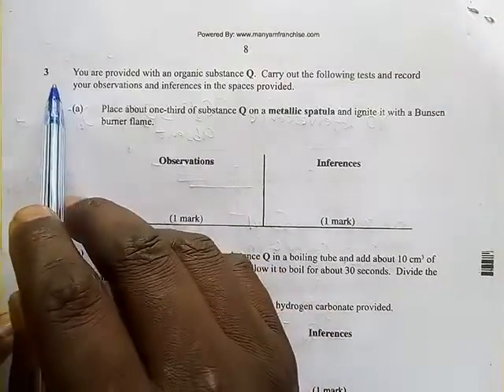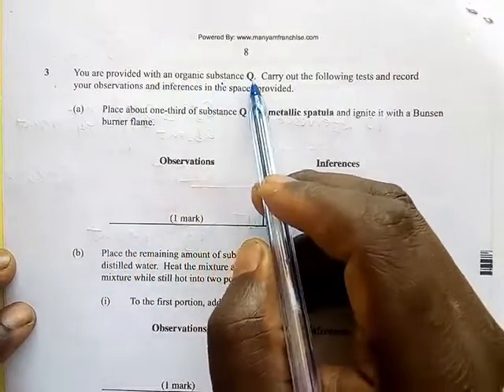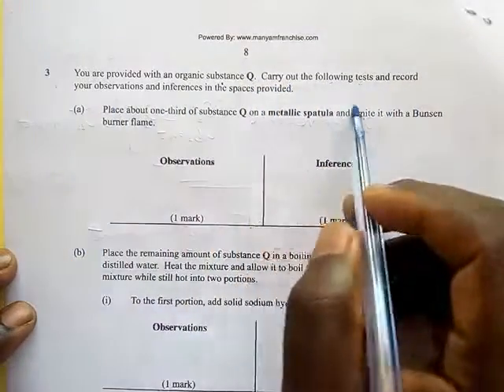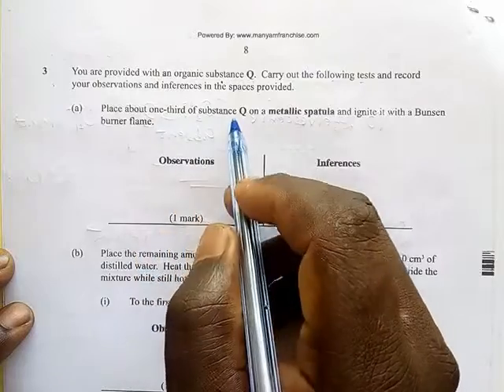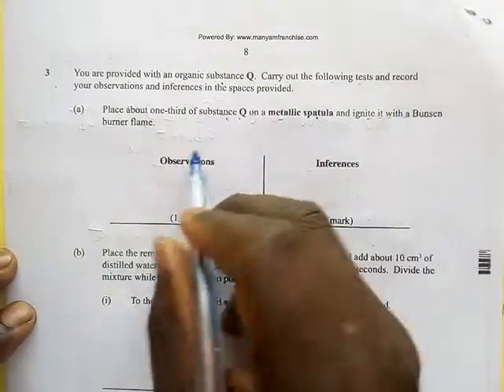The last part of it, number 3, you are provided with an organic substance Q. Carry out the following tests and record the observations and the inferences. Place about 1/3 of substance Q on a metallic spatula and ignite it with a Bunsen burner.